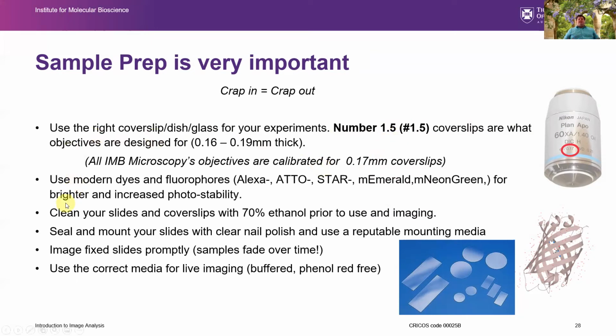Use modern dyes and fluorophores, so Alexa dyes, Atto dyes, Star, mEmerald, mNeonGreen. These will be brighter and have better photostability. Again, in some of our methods like STED, you really need specific labels for that method to work.